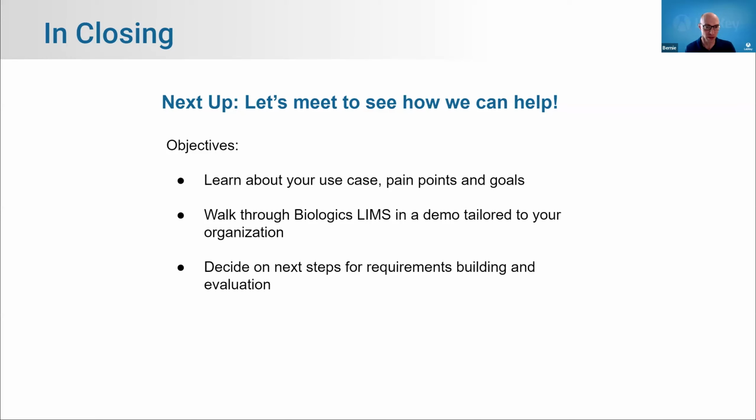And then I see, knock out bad values from an assay. So QC exclusions, things like that. Yes. If you import some data and then you have a look at it and you say, assuming the run as a whole is in good shape, which you can set up QC states so that when data first comes in, you have the ability for you or one of your scientists to say, hang on, there was something wrong with this run. I don't want it submitted for other people to be able to see it and make decisions based upon it.